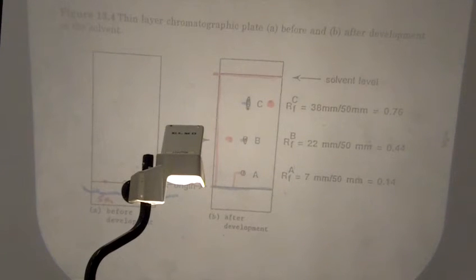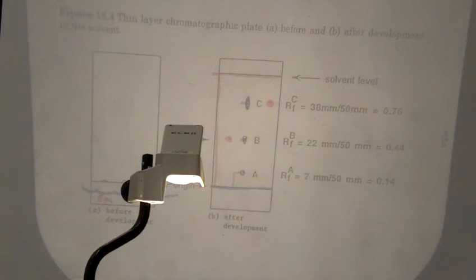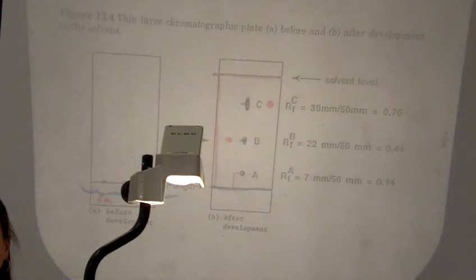So this week, when you're using the 1-to-1 hexane ethyl acetate, even though you may be looking at things on different TLC plates, their RF values can be compared to each other, okay, because you're using the same solvent system, all right? And so what we're going to do this week is use standards to help you figure out what is your product and what is your starting material.